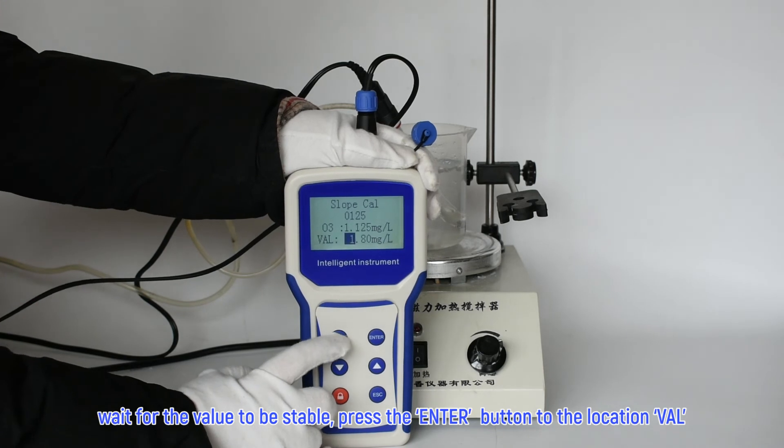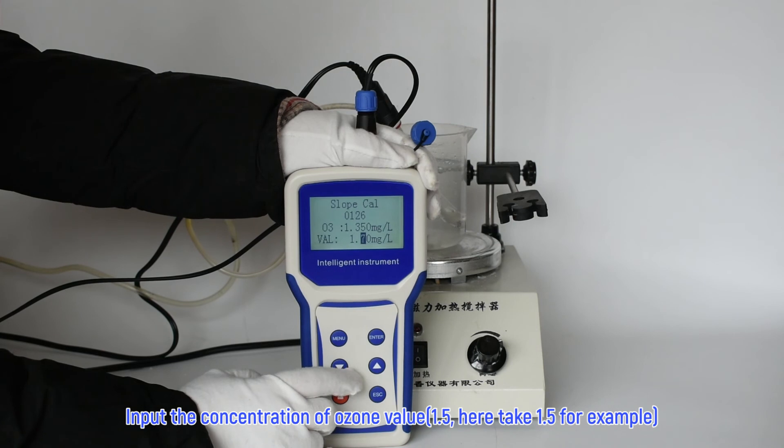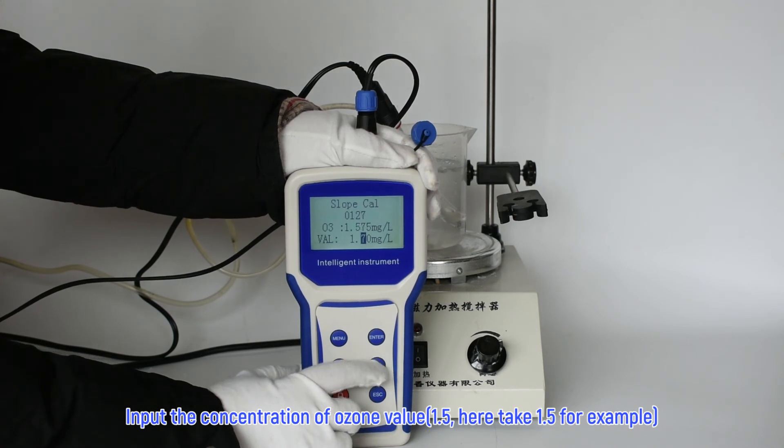Wait for the value to be stable, then press the enter button to navigate to the location VAL. Input the concentration of ozone value — 1.5; here 1.5 is taken as an example.